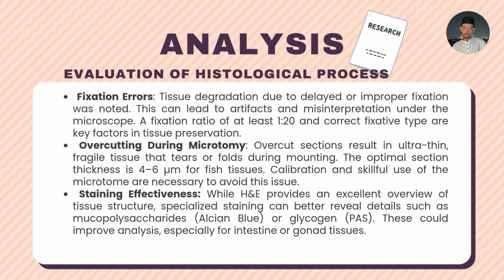Next, overcutting during microtomy. Overcut sections result in ultra-thin, fragile tissue that tears or folds during mounting. The optimal section thickness is 4 to 6 micrometers for fish tissues. Calibration and skillful use of the microtome are necessary to avoid this issue.